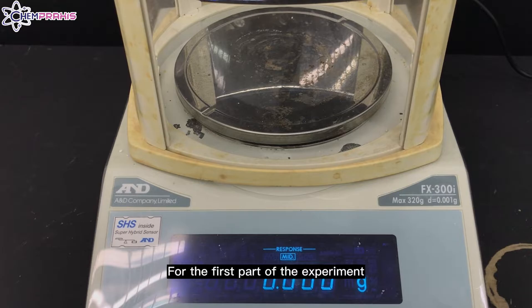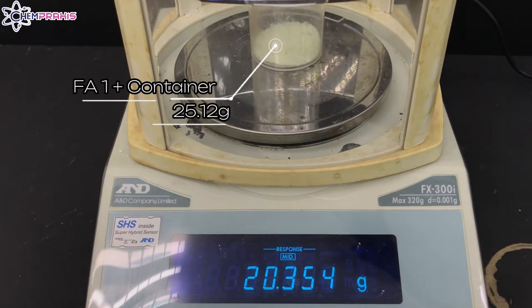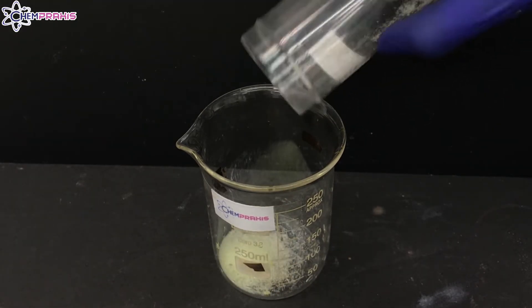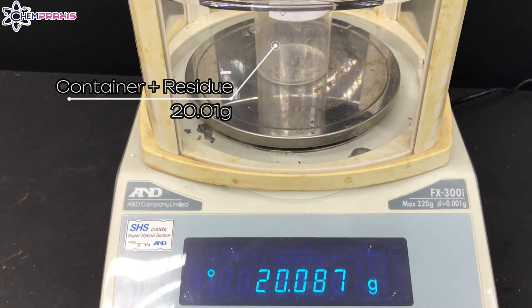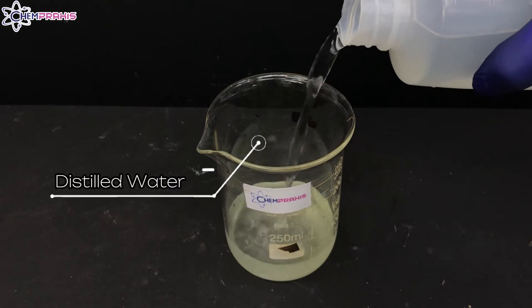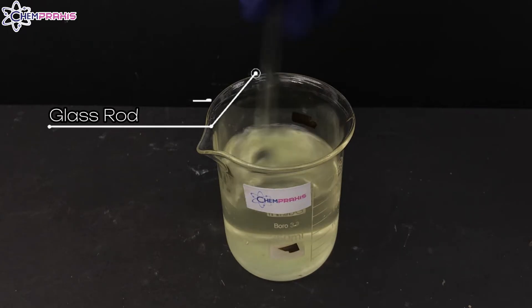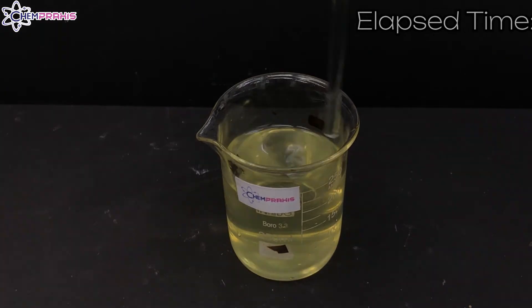For the first part of the experiment, we'll start with preparing a solution. First, we'll weigh the sample of FA1 and its container. Next, we'll add all the FA1 into a 250 cm³ beaker. Now we'll weigh the container with the residue. Then we'll add some distilled water into the beaker and stir the solid until it dissolves.